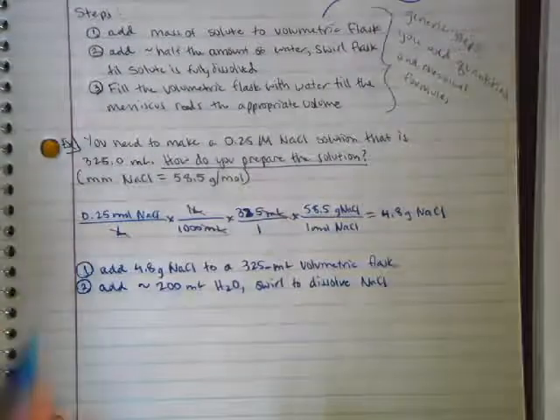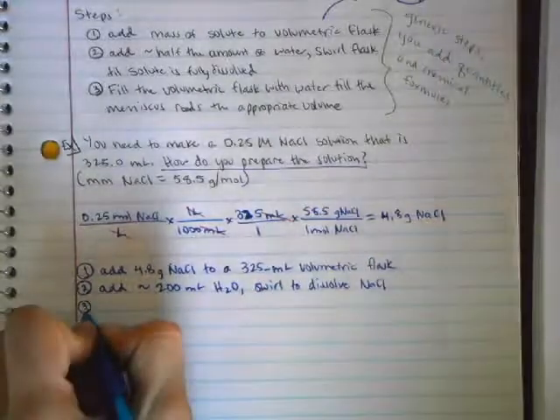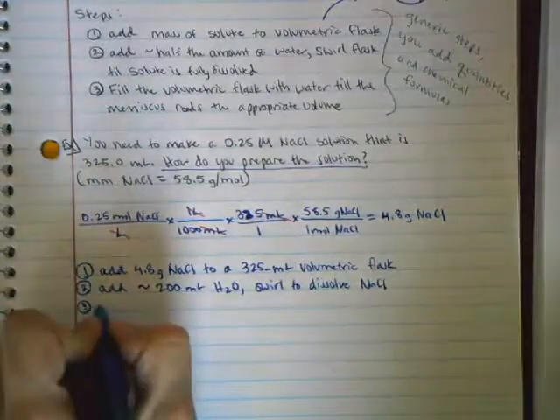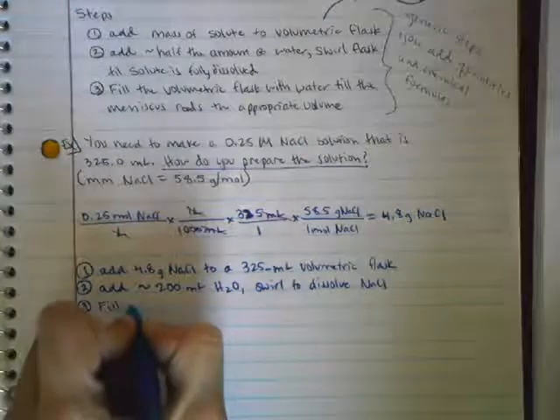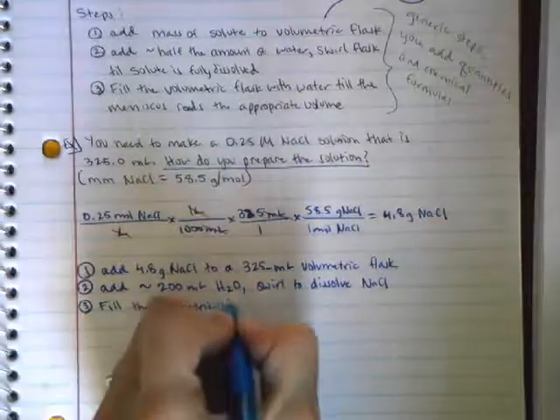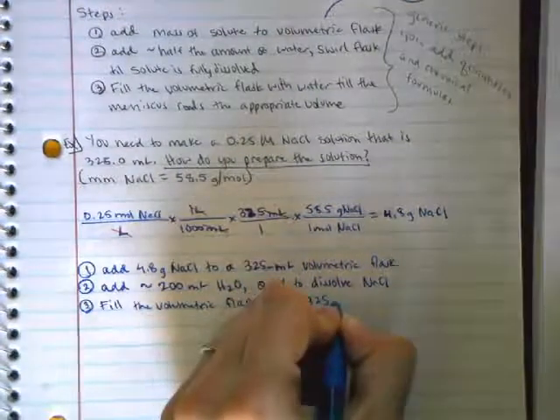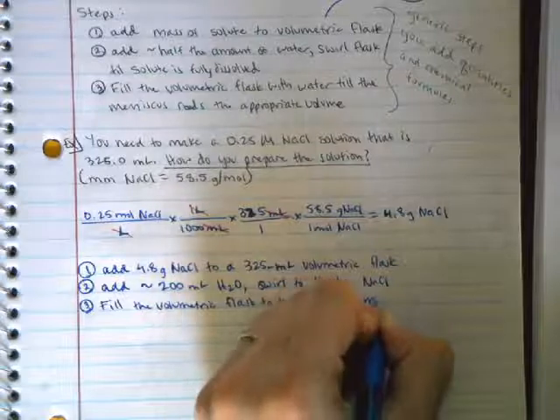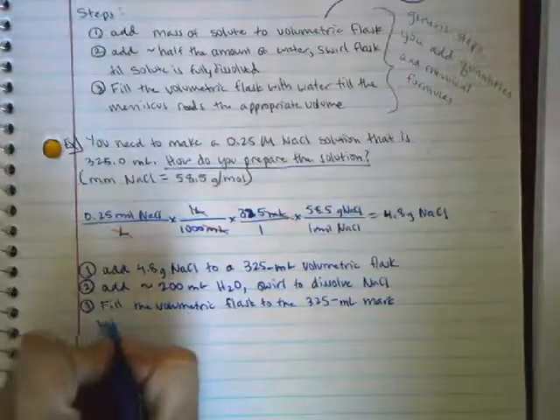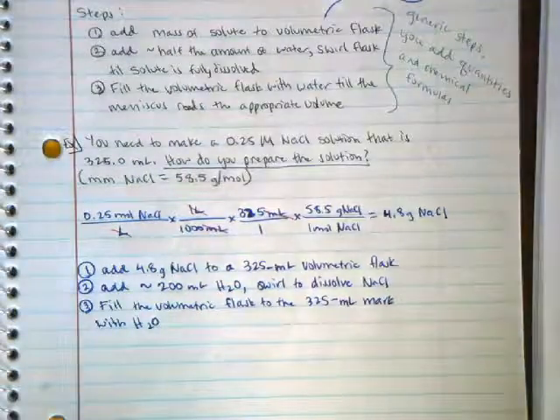And then step 3, once your salt is fully dissolved, you just fill the volumetric flask to the 325 milliliter mark with H2O. Not hard at all.